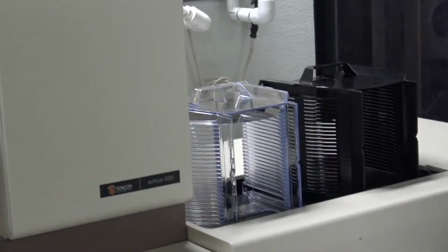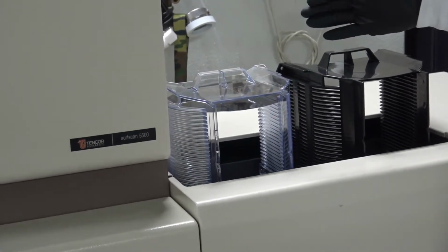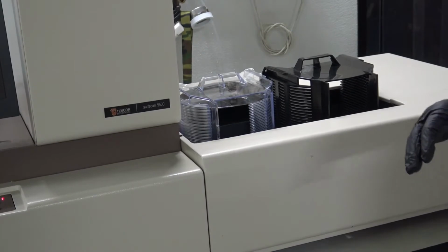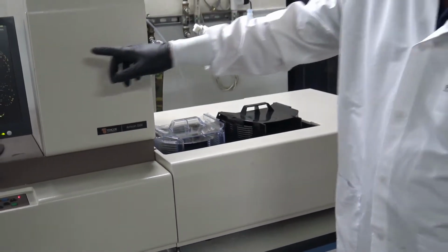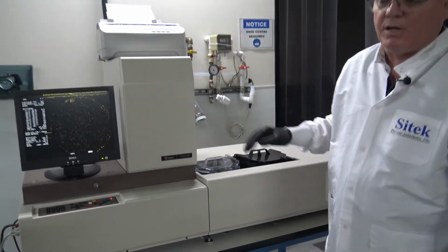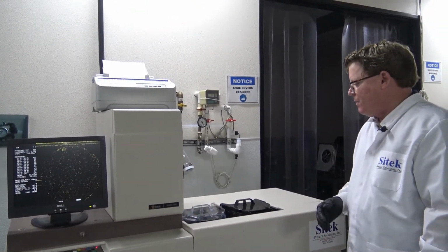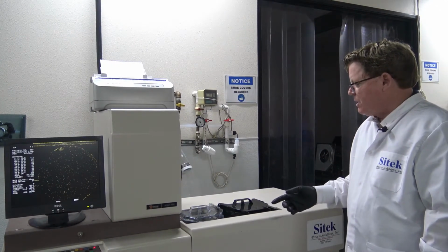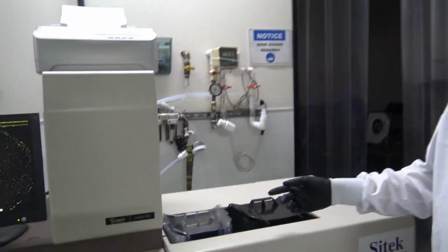As you can see, both elevators are now moving down. What's happening is the system is scanning for slots to see where the wafers are. This system also has the capability of scanning, and then the slots will come up on the right-hand side, and you can pick the slot you want. In this case, we only have one wafer, so it's only going to grab the first wafer. There we go, it's indexing now. The arm's coming out. There's the wafer being taken. And there's the 8-inch wafer.